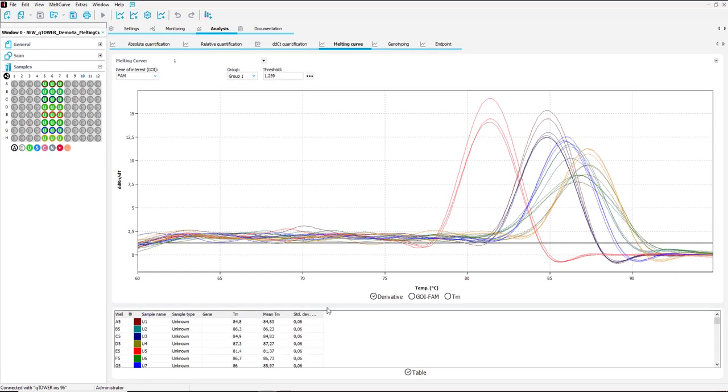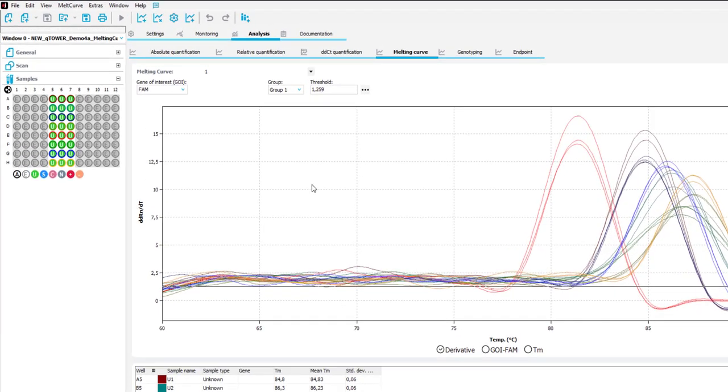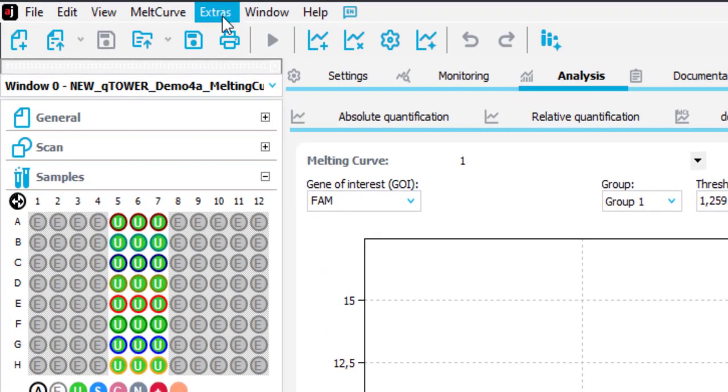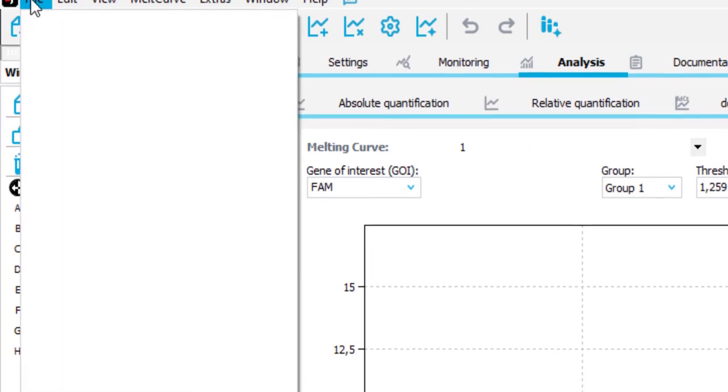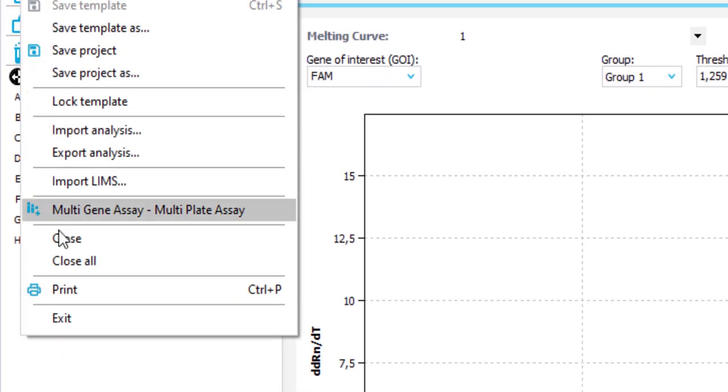For a more detailed export of the results you can create a print report. For this you either click onto the icon or via file and print.